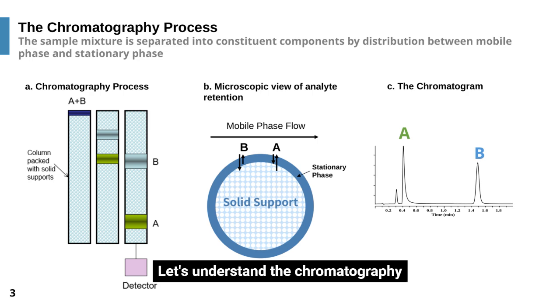Let's understand the chromatography process. The sample mixture is separated into constituent components by distribution between the mobile phase and the stationary phase. This slide illustrates the chromatography process, shows a microscopic view of analyte retention, and presents a typical chromatogram.